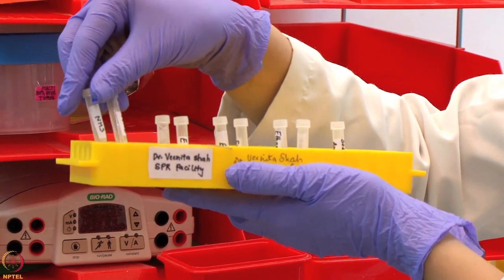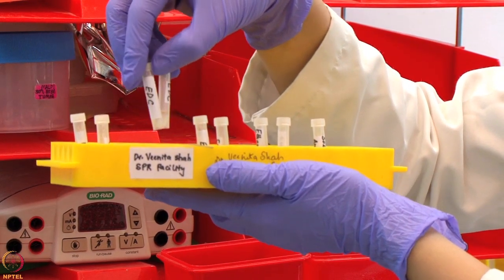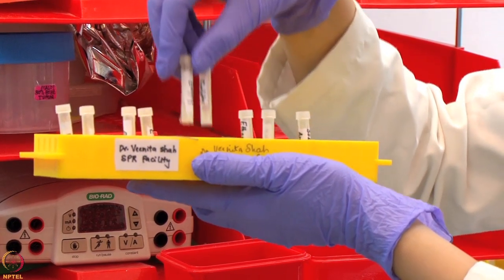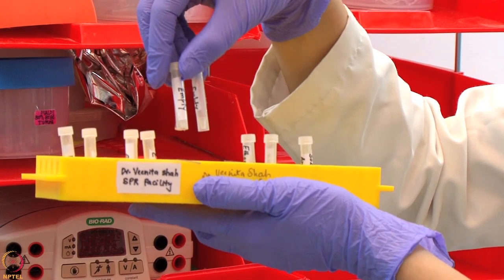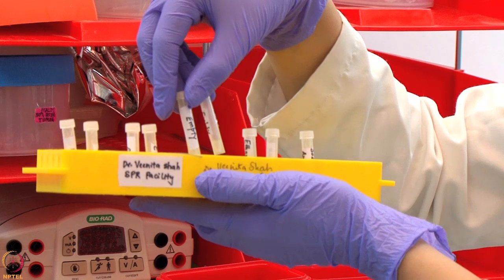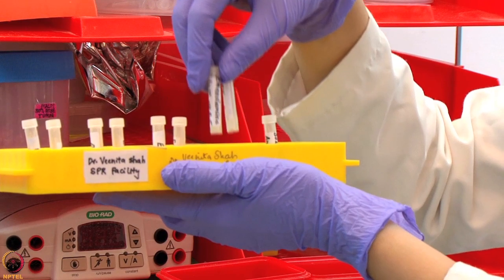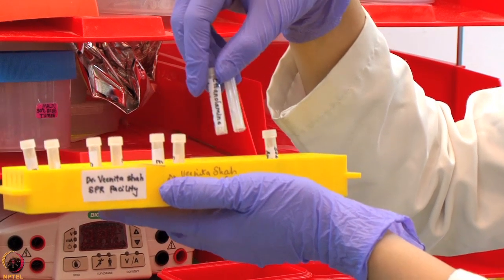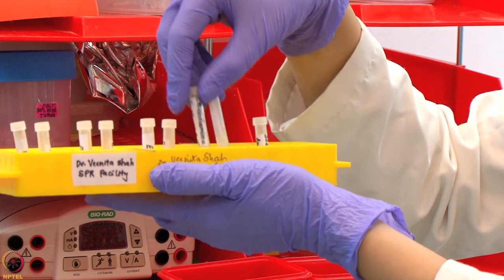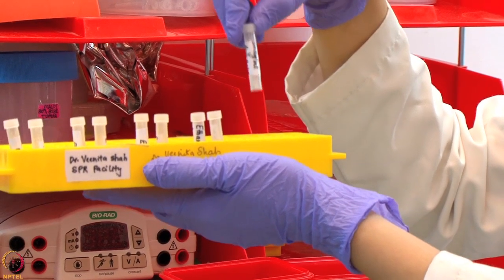So we have 2 NHS tubes, 2 EDC, 2 empty tubes for longer stability of EDC NHS, which will be mixed inside the system, 2 ethanolamine tubes, one for the blank flow cell and the other for the active flow channel, and 1 ligand solution.